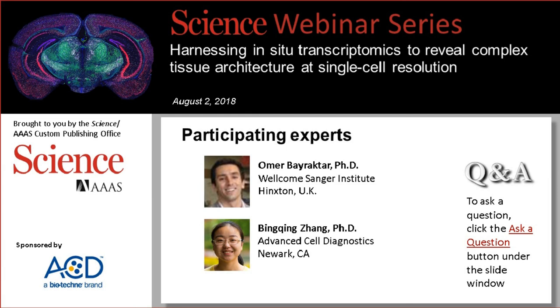Yet there will be a couple of problems when you're dealing with human tissue sections. First, the amount of data, the data acquisition length, and the data size that will be generated will be much higher. So, for efficient screening, you need to be able to scale up your imaging operation by using additional systems.